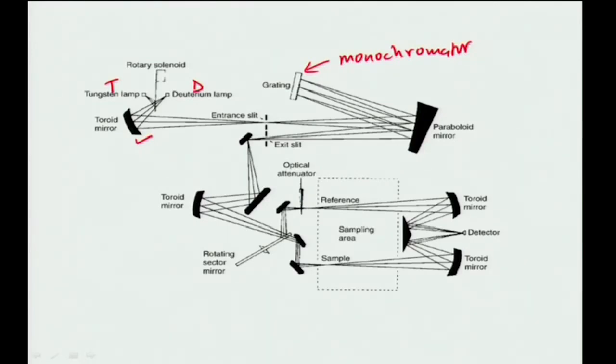The monochromator might have one grating or two gratings, depending upon that, it would be a single grating or double grating. This grating helps disperse whatever light is coming in. Once it is dispersed, the light comes back to the parabolic mirror, the mirror which reflected the light onto the grating collects it again. Then it comes through the exit slit like this. So one was the entrance, through which it went towards the parabolic mirror, went to the grating, came back to the parabolic mirror, the parabolic mirror refocused it, and it came through the exit slit.